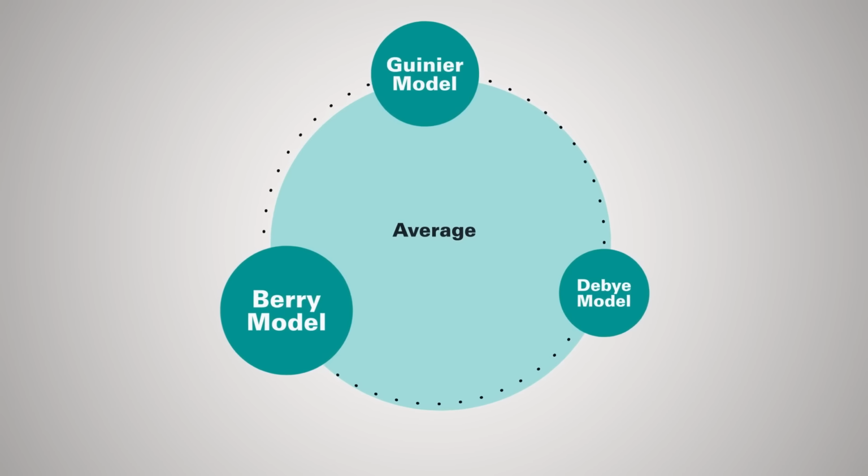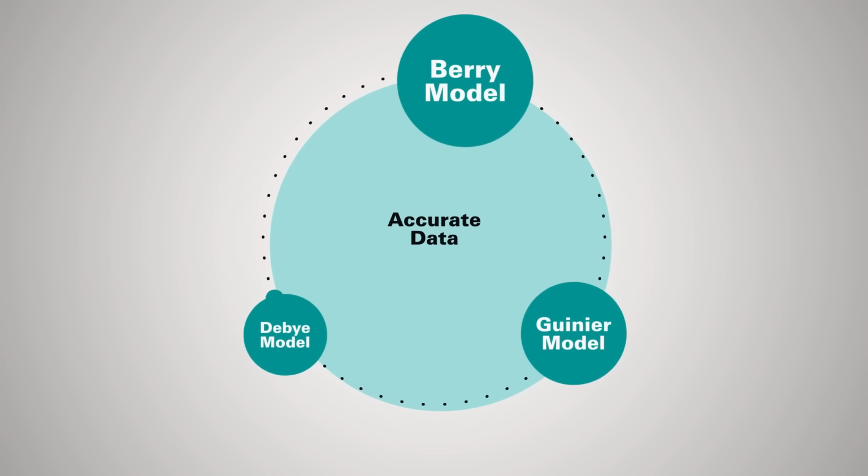Why is this important? When you go to extremely low angles, for example 10 degrees, the angular dependence can be ignored. In that case, you can do a direct measurement of the molecular weight, which is assumption-free. If you do it traditionally, from 30 to 150 degrees, based on the size and shape of the sample, sometimes you need to apply different models to fit the data to get accurate results. It's a little difficult for users just starting with light scattering because there is a learning curve with the technique. With this assumption-free innovation, you do not need to worry about this part.